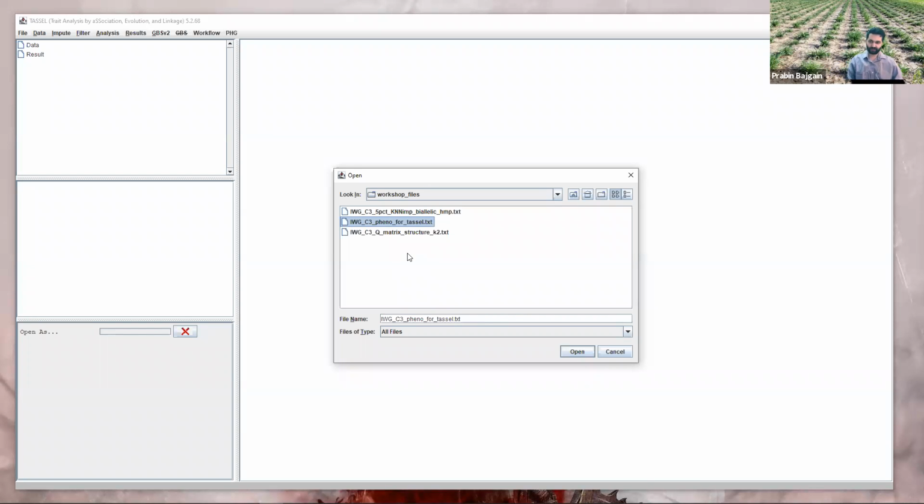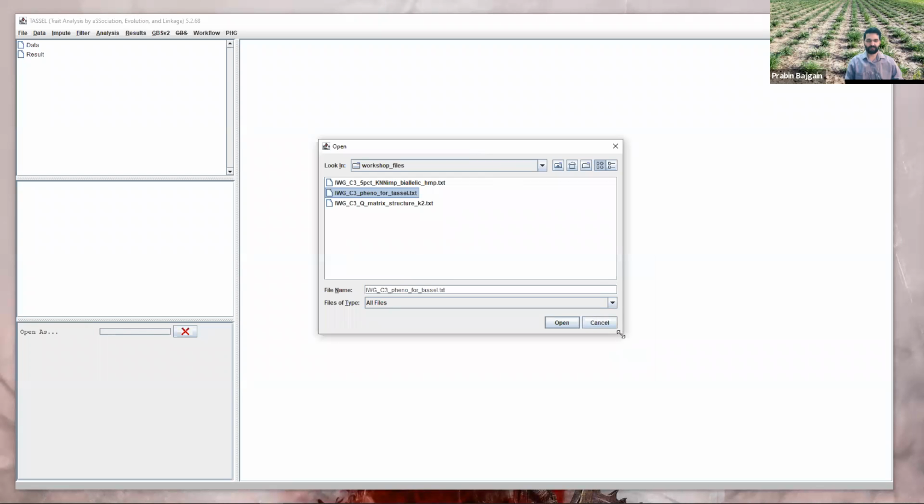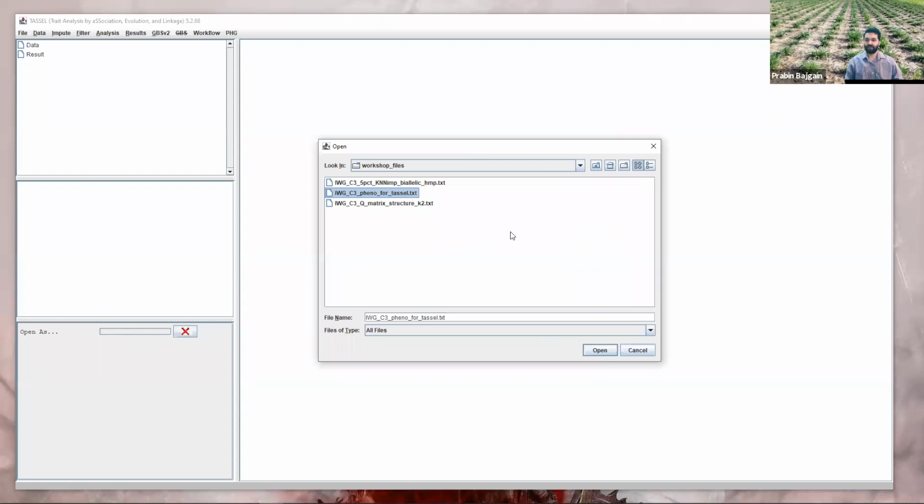Of course, we're not going to go through that today. But if anyone is interested, just let me know. You can run it on Windows, probably Mac too, but I mainly do it on MSI. It takes quite a bit of time, especially if you want to do 50K or 100K iterations. It's not a difficult program to figure out, but there are a lot of parameter options and so forth. However, I do have the output in case you want to see what the output looks like.